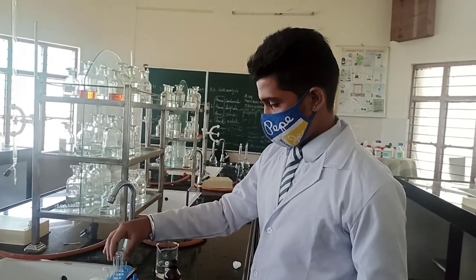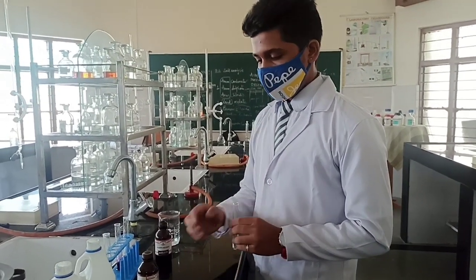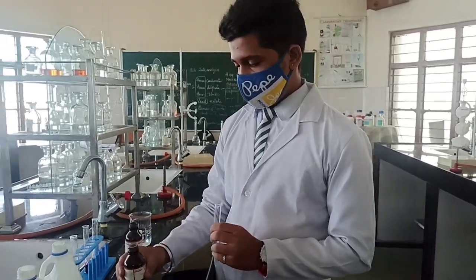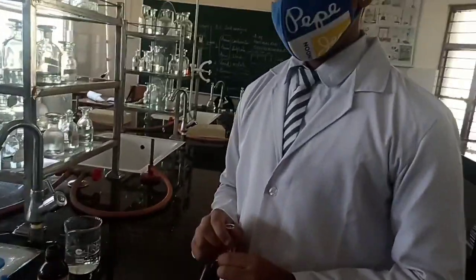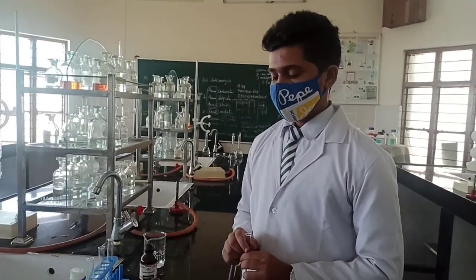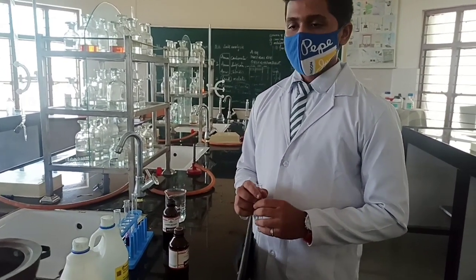Now the second test is Tollens test. In the market, Tollens reagent is already available ready-made. If you don't have Tollens reagent in the lab, you can prepare it: take silver nitrate solution, add dilute NaOH to it, followed by addition of ammonium hydroxide — the combination of these three gives you the Tollens reagent.